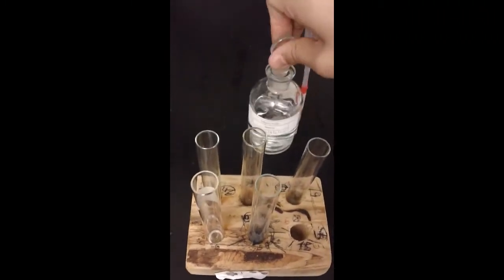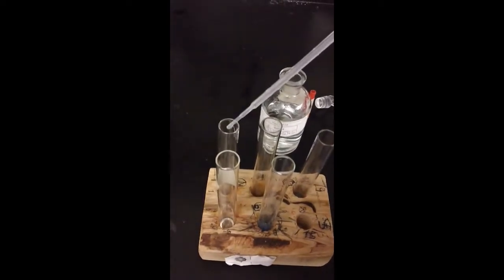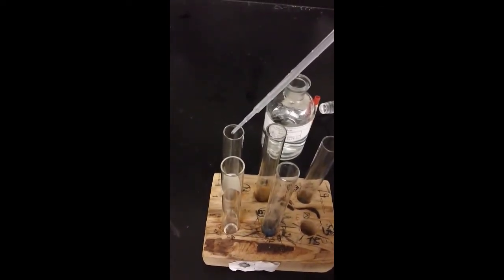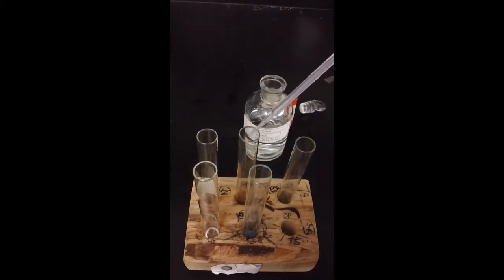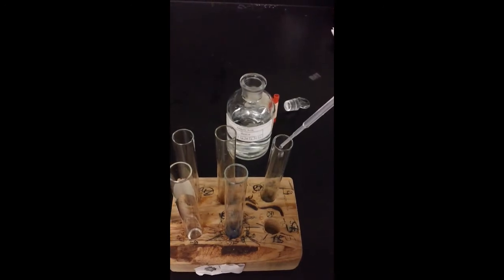Okay, so I'm moving, being very, very careful. All right. So now I'm here by my sulfuric acid and I'm double checking H2SO4 on the bottle before I put it in. So I'm adding 8 drops into each of my test tubes. So here we go. Adding 8 drops. 1, 2, 3, 4, 5, 6, 7, 8.